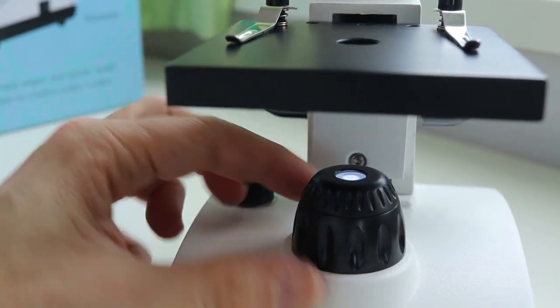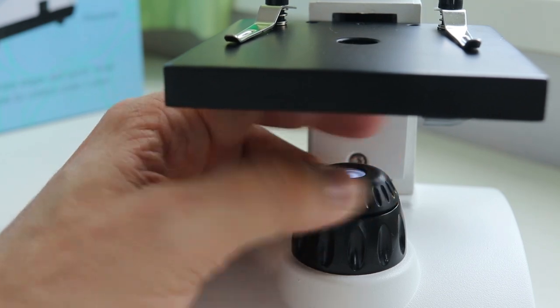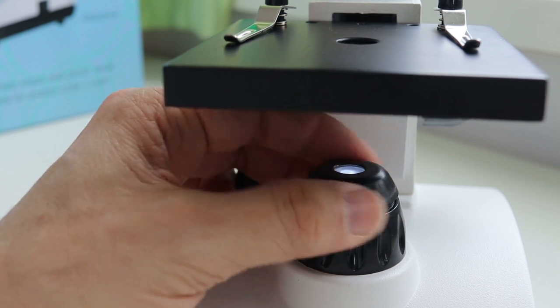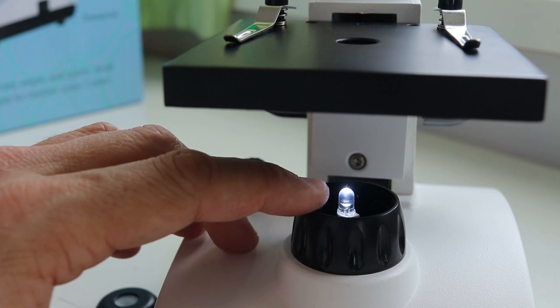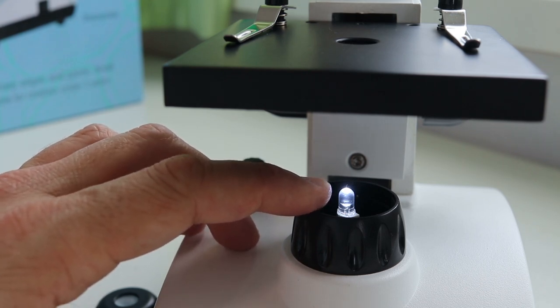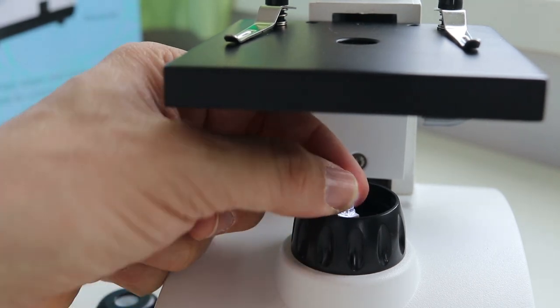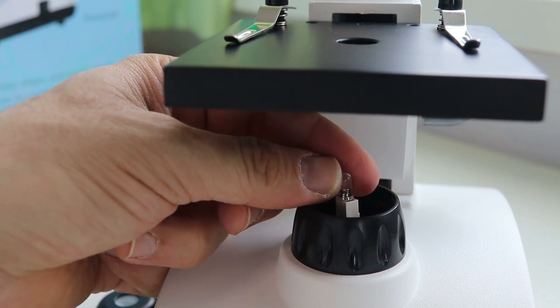But there is one thing that I like about this, and look, you can take this top part off, and you can directly access the LED. Why do I like this? Because you can exchange it. LEDs don't break easily anyway, but should they break, you can get yourself a new one and simply drop it in here. I don't know, let's see if I can pull it out. Yep, see, you can pull it out.